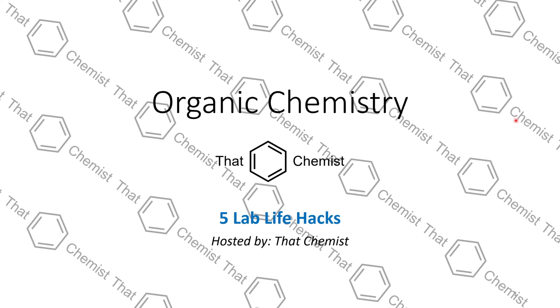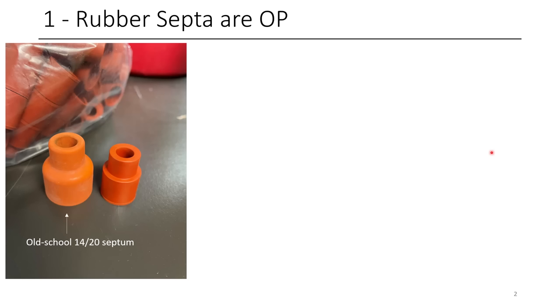Welcome back, I'm ThatChemist, and today I'm going to tell you about five lab life hacks. So the first life hack is one of my favorites, and it's using these 14/20 rubber septa.